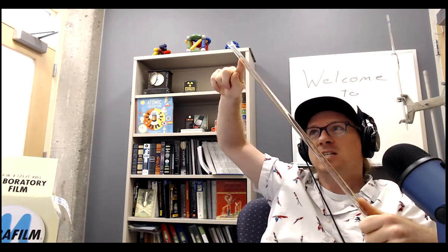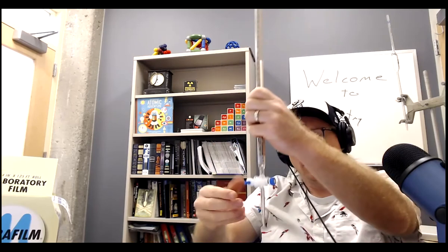You might even rinse this one twice because it has a lot of surface area, and we don't know what people used this for last. So rinse it twice. You have extra cerium, so it's better to do a couple more rinses. Again, you close it, put the funnel on, and fill it all the way up to 0. It's easier to fill it up beyond 0. Get this over your waste beaker and then slowly open it to get the meniscus right on the 0.